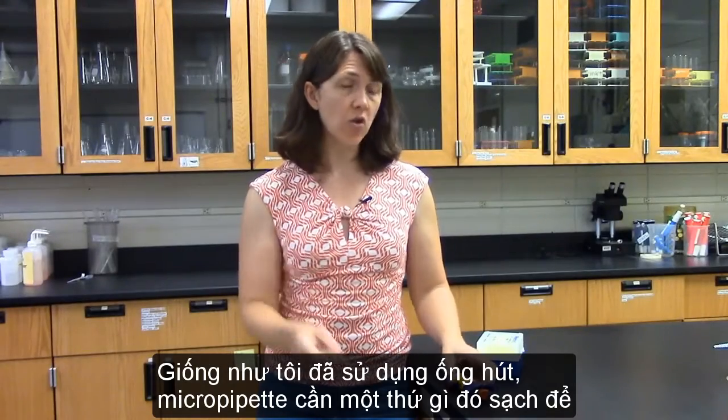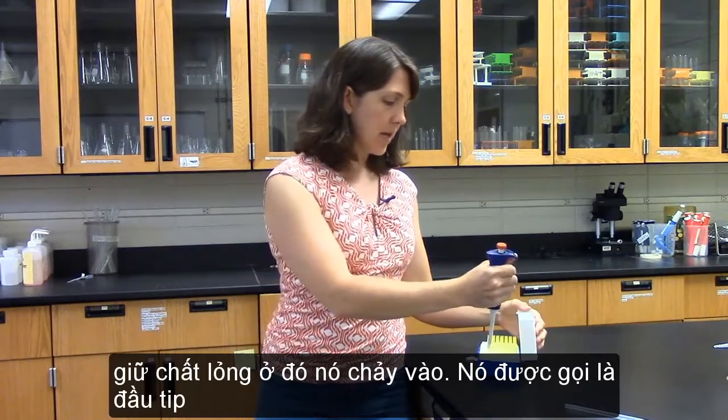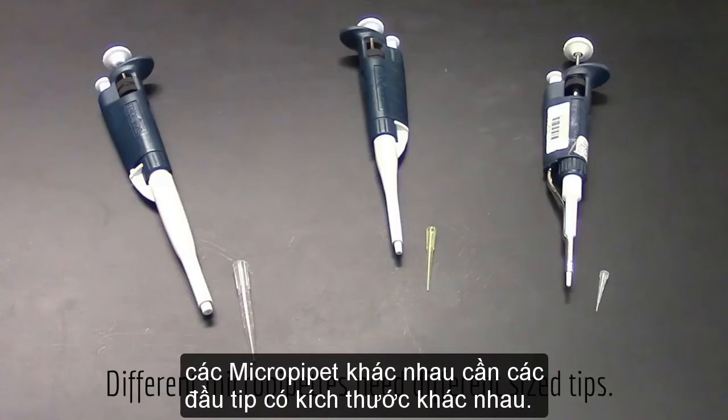Just like I used a straw, the micropipette needs something clean to hold the liquid. That's where this comes in. It's called a tip. The tip is clean and it holds all the liquid. Different micropipettes need different sized tips.